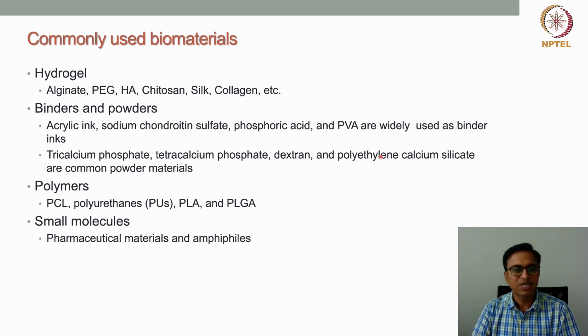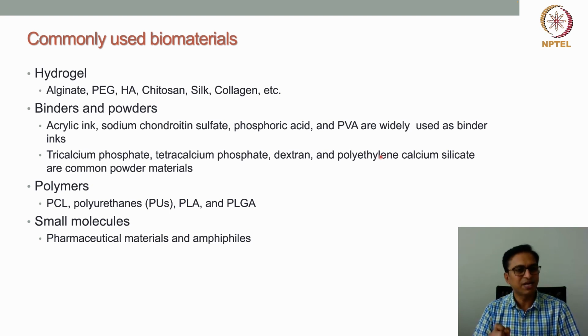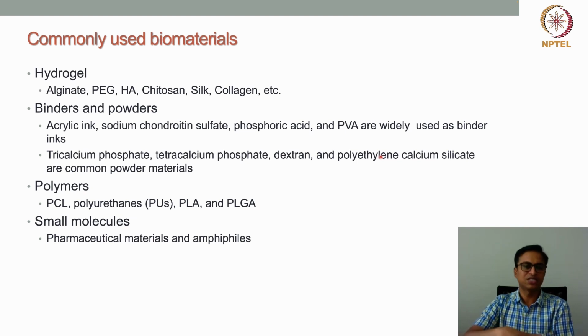So that's why different types of binder materials are used, and this can also be done in two ways. Either the solid or dried binders and powders are mixed together, and then placed on the stage. Then the aqueous droplets, or binder droplets, which can be either aqueous or organic, are produced and sprayed on this.